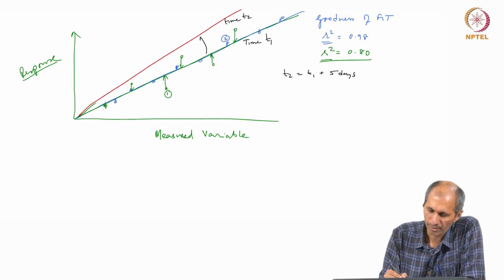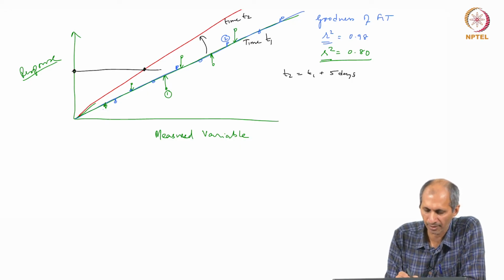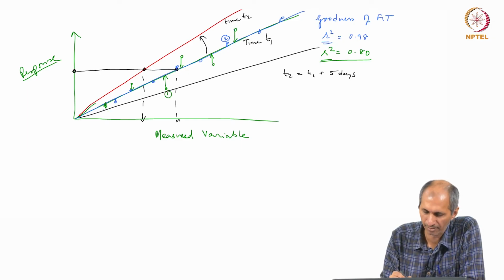as you are going from here to here, because if I take an unknown sample, I am following this calibration curve, but the calibration has changed internally and I am not noticing it. I follow this older calibration, which means that I may be overestimating the concentration based on my older curve, but the new calibration curve is showing a smaller value, or worse, it may be like this, where I am estimating a lower concentration than what it actually is, okay.